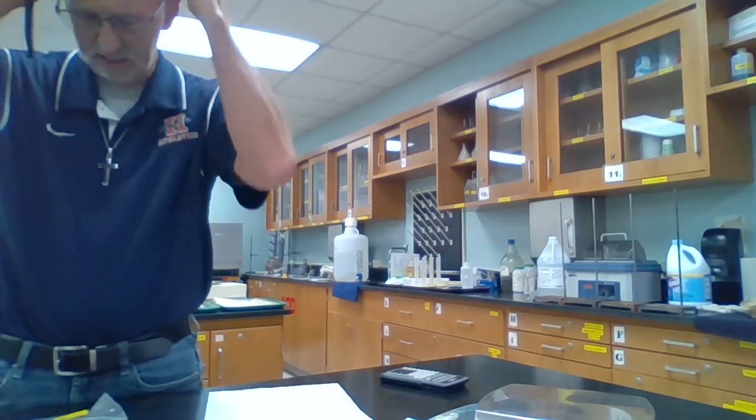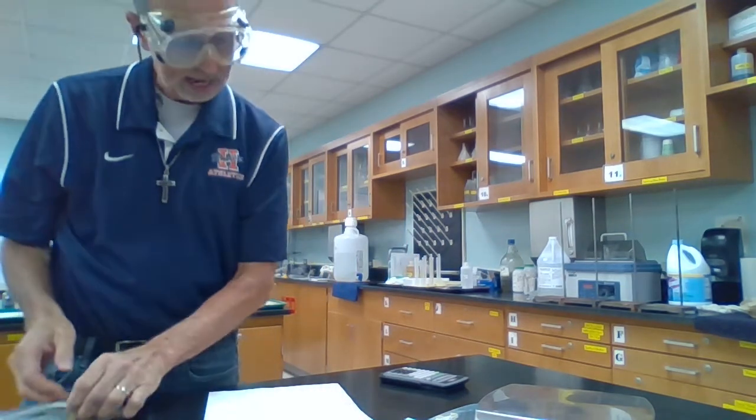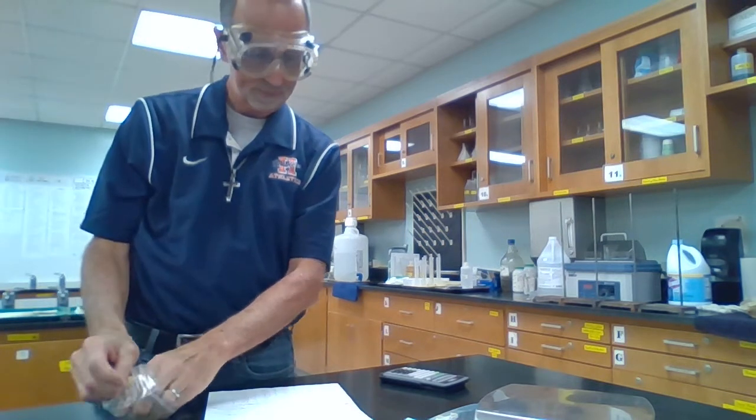of each type, and then we're going to find their volumes. Again, I'm going to find the masses first because we're going to have to find the volumes by water displacement, and I don't want to be finding the mass of pennies that could be wet. Even if you dry them off, there's probably still some water on them that will affect the mass. We don't want to do that. So we'll do all the masses first, and then we'll come back and do volumes. So let's take a look here at the pre-82s first.